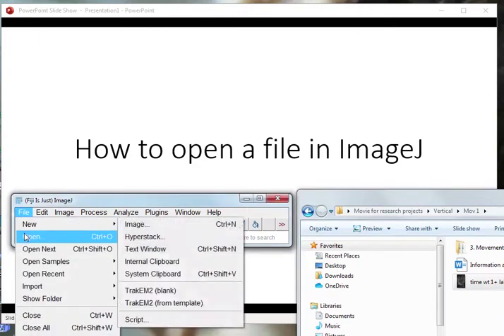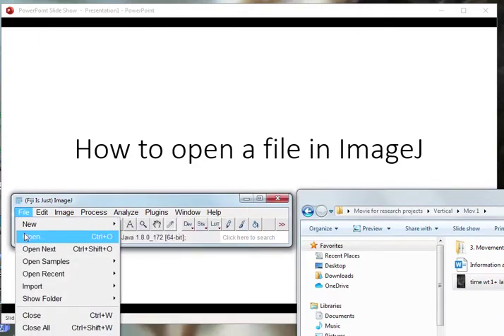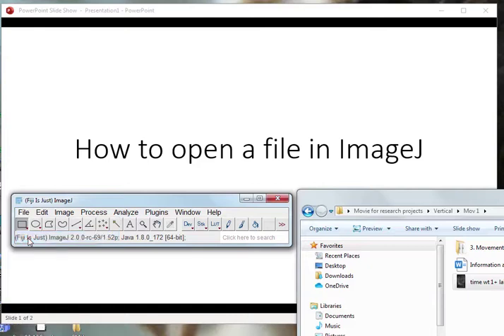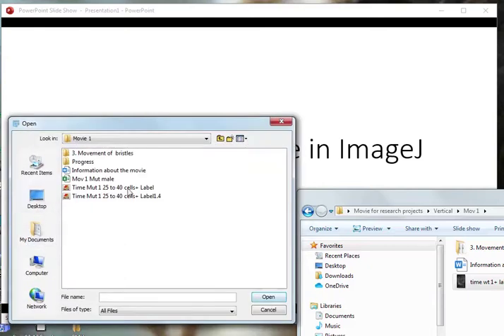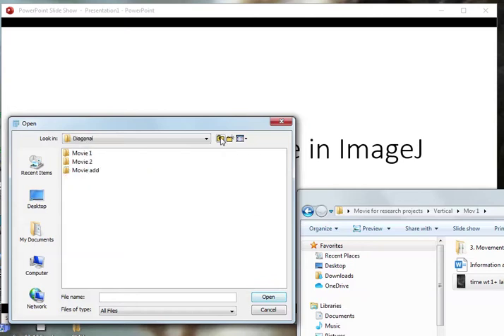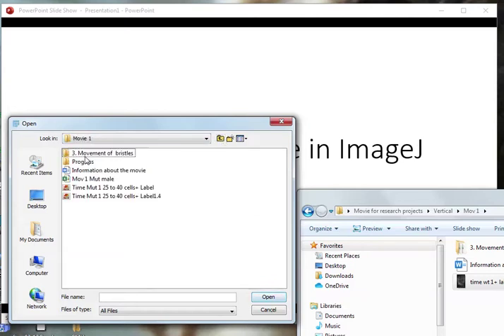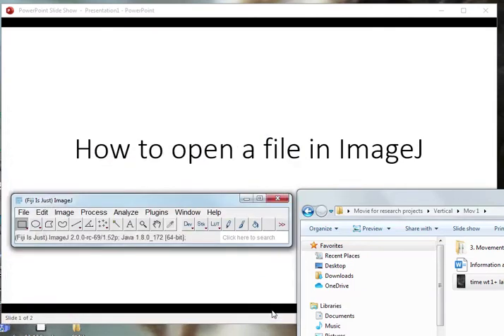You can left-click if you're using Windows and you can go to Open. You look exactly for the folder of the movie that you want to. You can look for, for example, if you want to open this one.